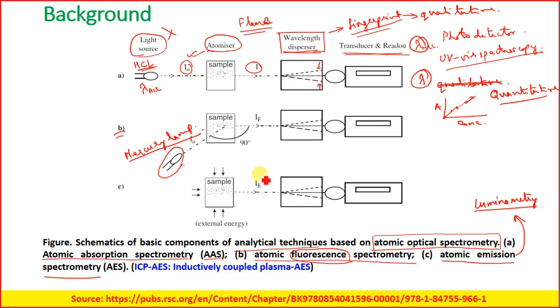And just like in a luminometer, during the atomization process, whatever light is generated is collected and analyzed.